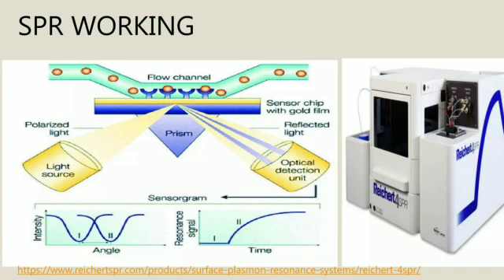Another question is, how is the surface plasmon resonance data displayed? The system monitors the interaction between two molecules, of which one is attached to the sensor surface and the other is free in solution. A sensorgram is a plot of response against time showing the progress of this interaction. This curve is displayed for us directly on the computer screen during an analysis.